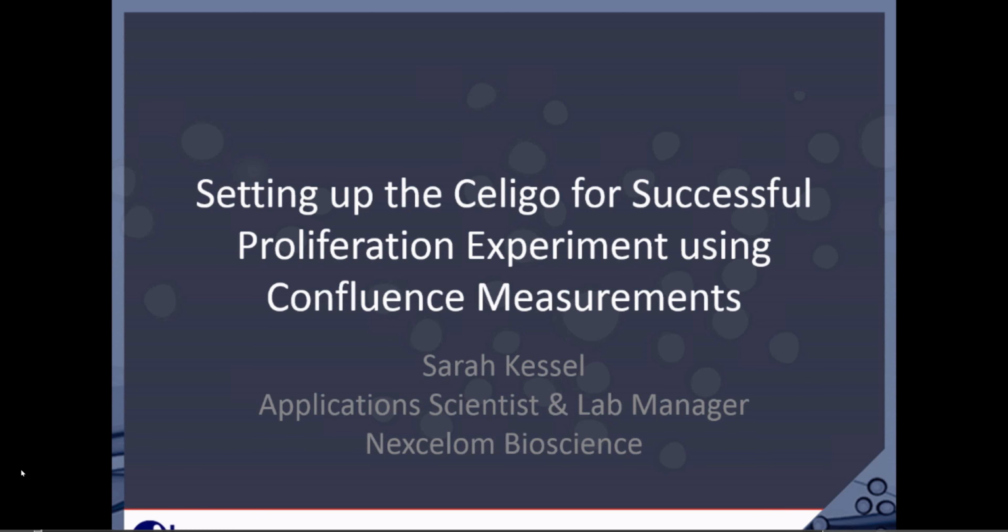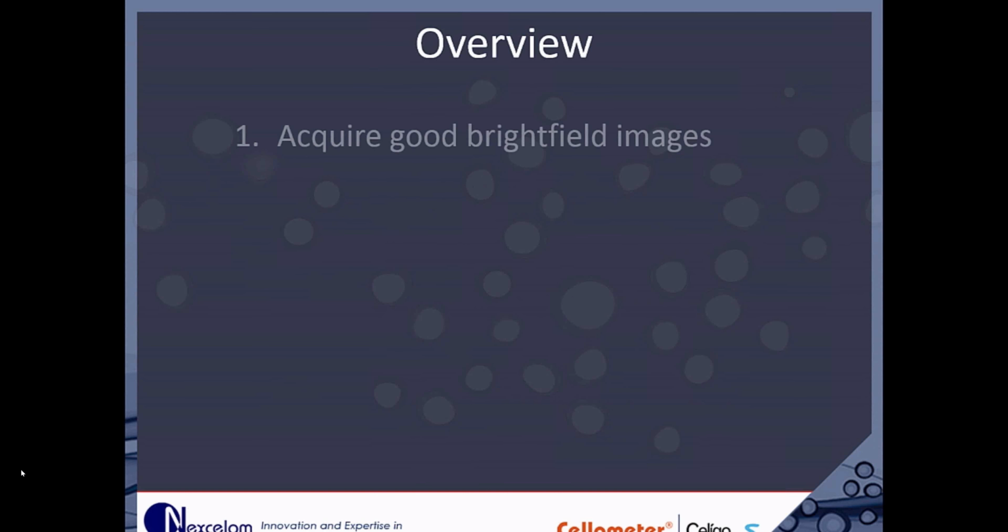I just wanted to plug that if you're a new user, this is a perfect application training webinar for you to get started on Celigo, or a refresher for what's important on acquiring bright field images on Celigo. So that's kind of the first part of what we're going to cover.